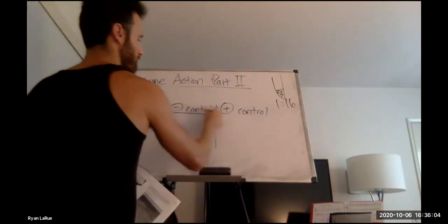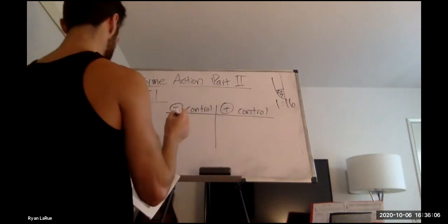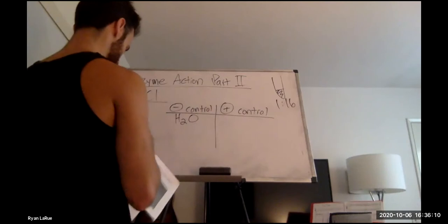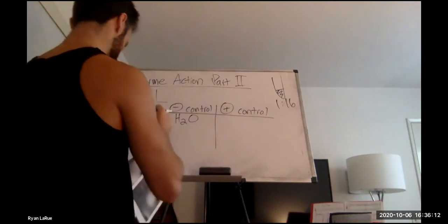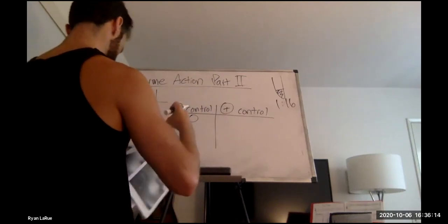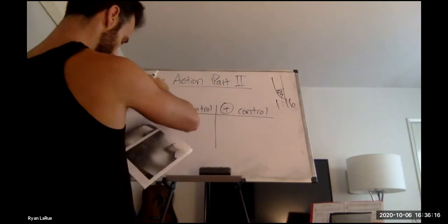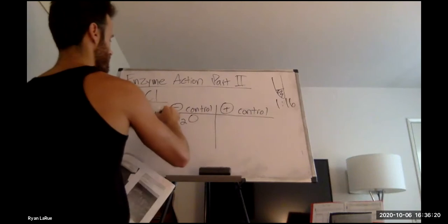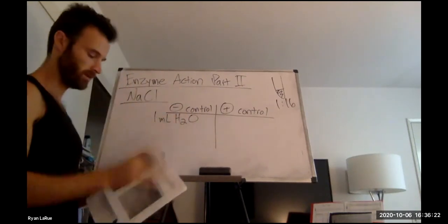The negative control is going to have water, 1 milliliter of water.